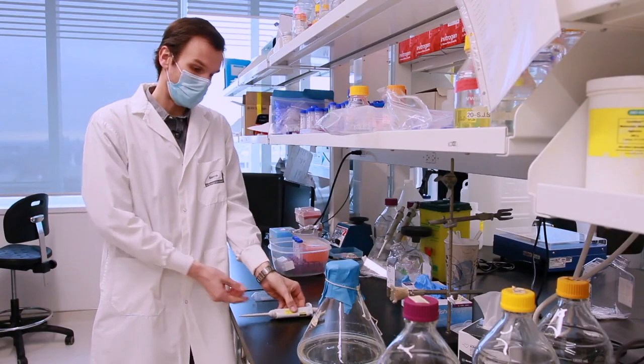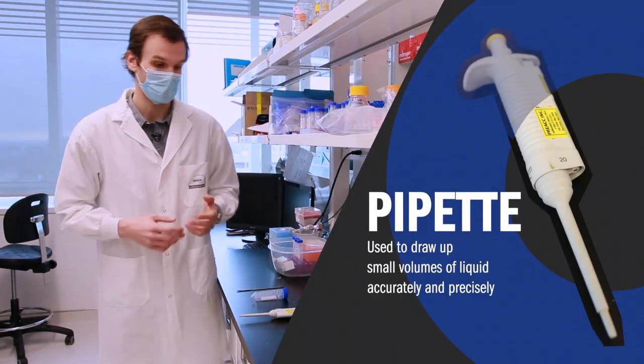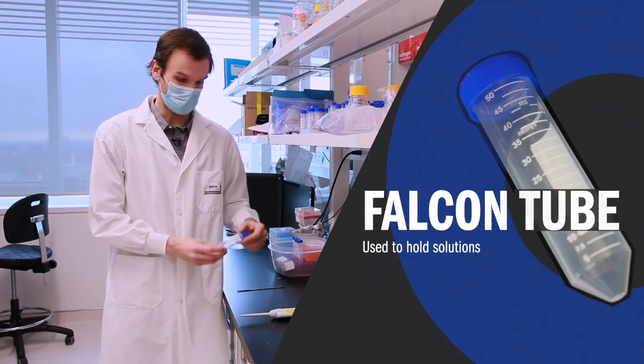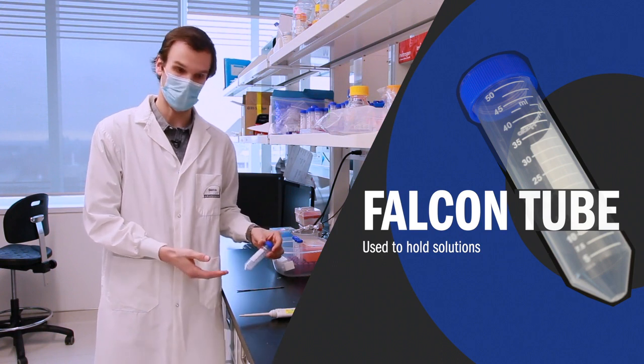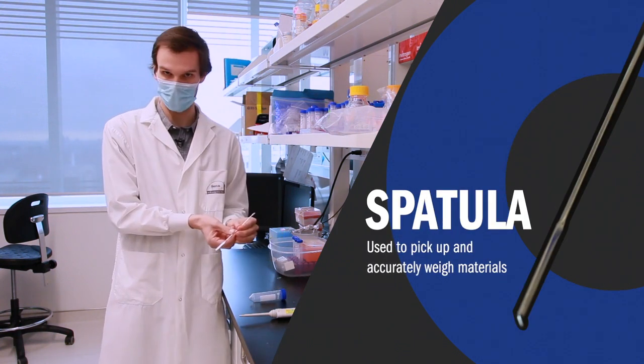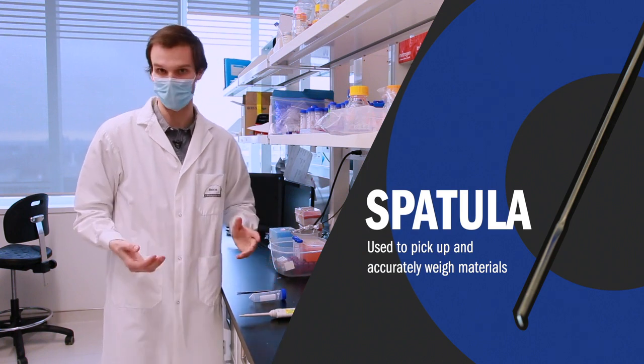Alright, so here we have a pipette, and it allows me to pipette accurately and precisely small volumes of liquid. Here we have a falcon tube. We put solutions inside of it. If you want a test tube, go find chemistry. Last but not least, we have the spatula. This is what I use to weigh out dry chemicals, salts, or even protein.